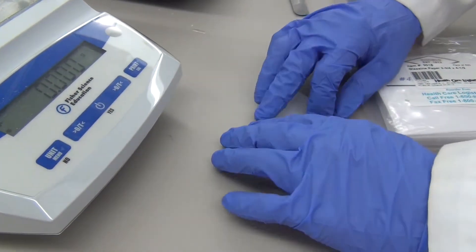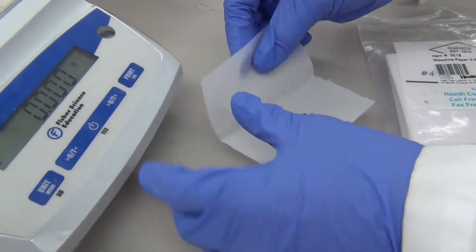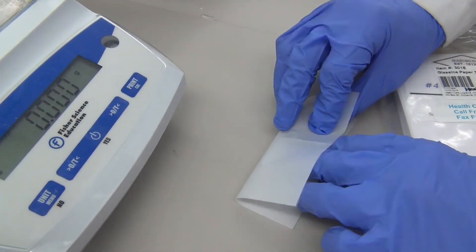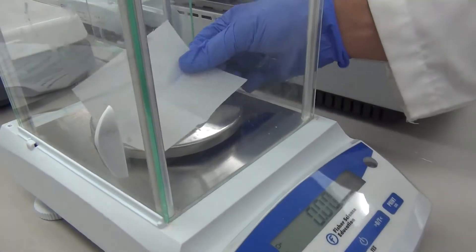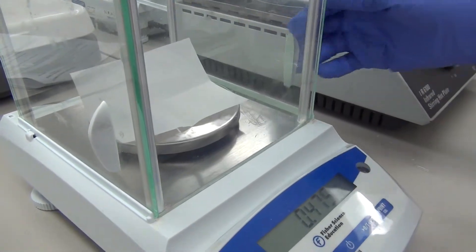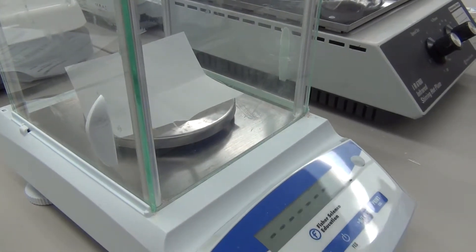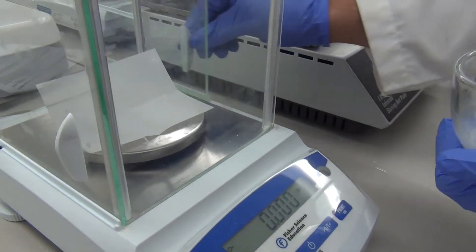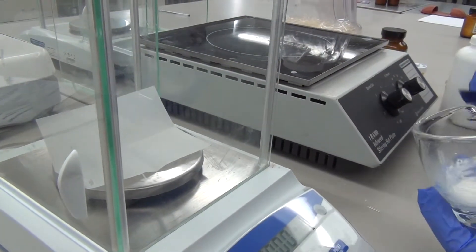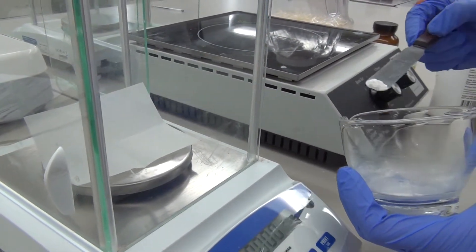It's a good idea to fold your weighing paper before you add the drug so that the drug doesn't easily fall out. Go ahead and weigh out the amount of drug needed to fill the prescription.